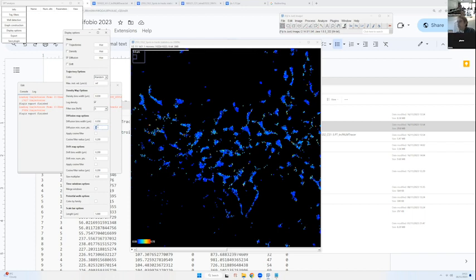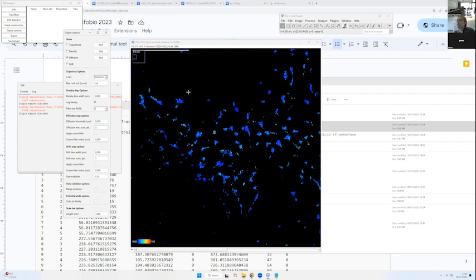Now, one thing we can do if we want to improve the resolution is to use the cosine filtering that David presented. When we do cosine filtering, we decouple the square grid from the computation.